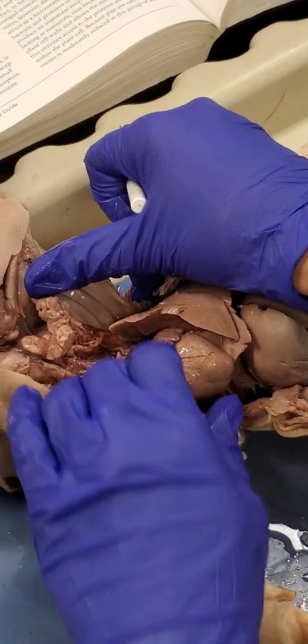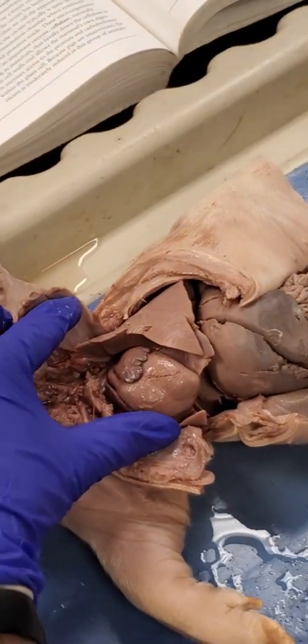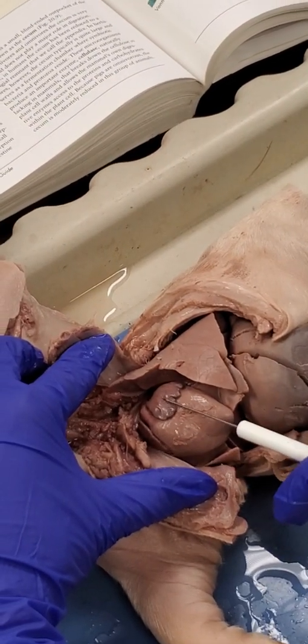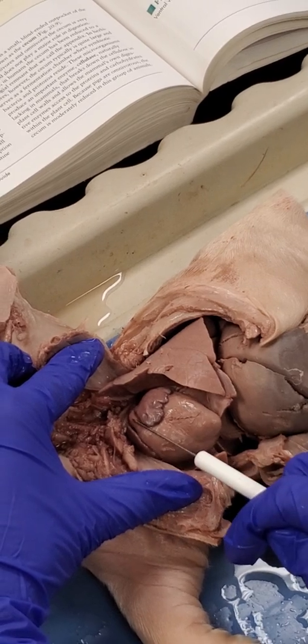So that's the aorta, you said? Aorta. Yep. Which was the atrium? So see these right here? Okay, yeah. They look darker. Left and right atrium, left, right ventricle, aorta.